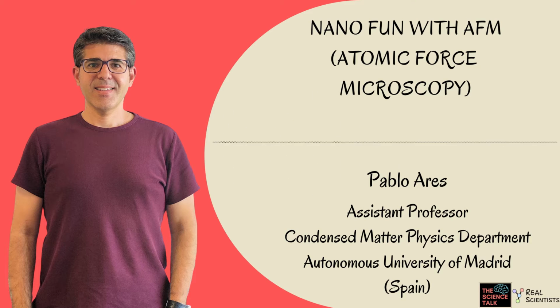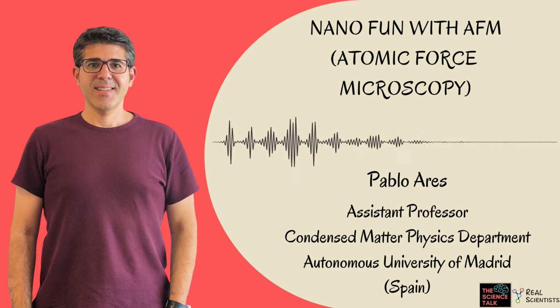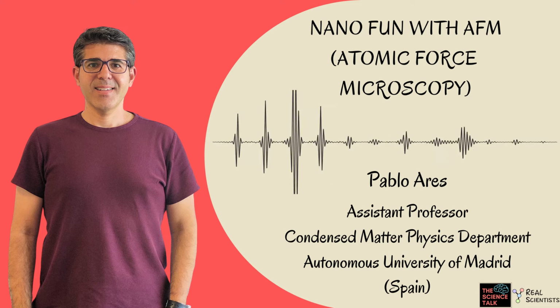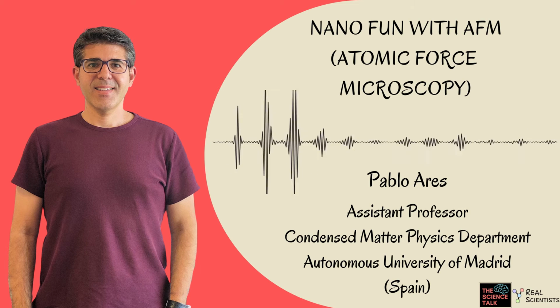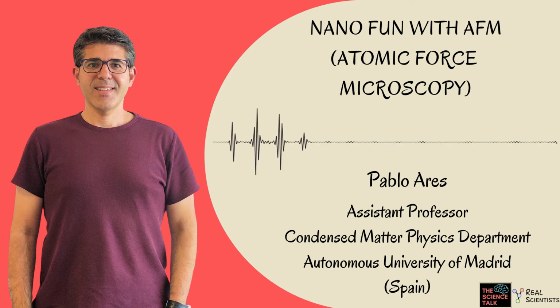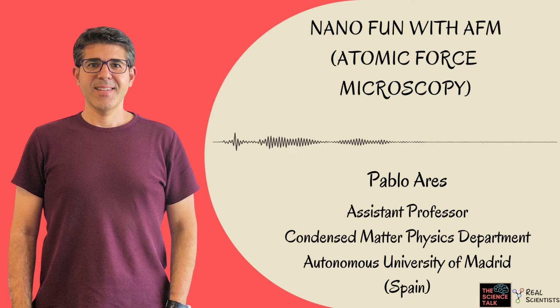But as I told you, I would also talk about 1D, like the gold nanowires, and I will try to cover, based on my experience, 0D materials like nanoparticles, 1D materials like nanofibers or nanowires, and then 2D materials like graphene, antimonene, and other materials and combinations of them.